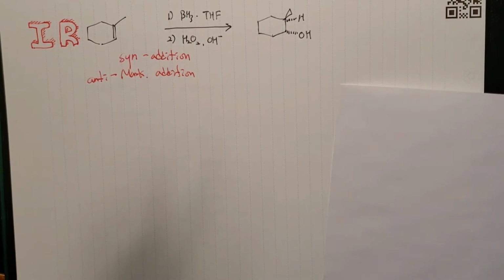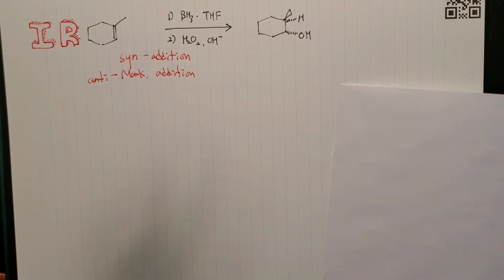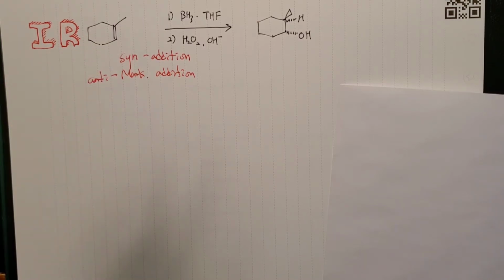So you may detect the disappearance of the reactant on the TLC, but you're not detecting appearance of the product. And if you even see something on the TLC other than the reactant spot, it's not necessarily this compound, and you don't know. So that's why IR can be useful when you intend to monitor the reaction.